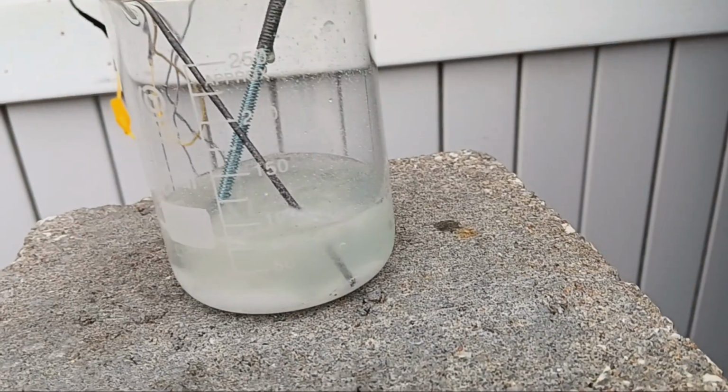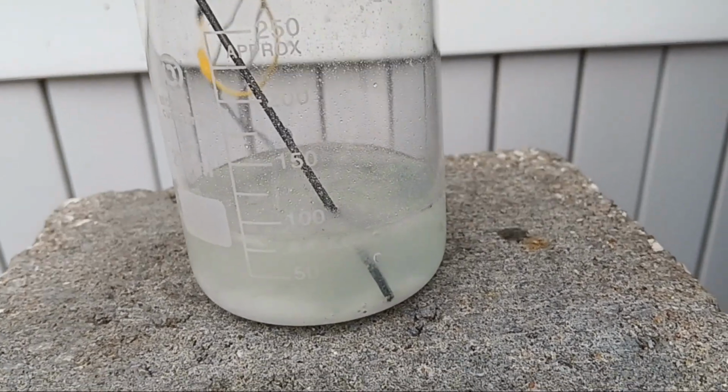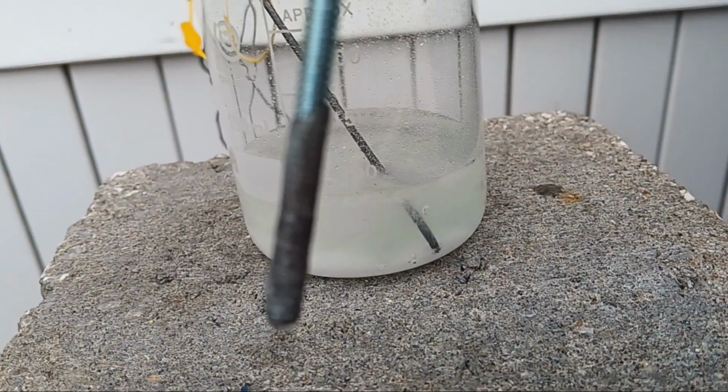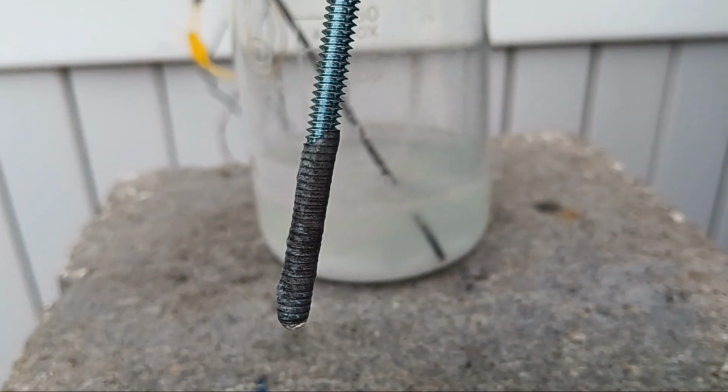It's barely audible on the camera, however, it was very audible when I was working. If you're wearing headphones, you may be able to hear it, although you may also just hear the wind chimes. Continuing on, you can see how the electrode has deformed. It is quite impressive how such little time can deform an electrode so much.